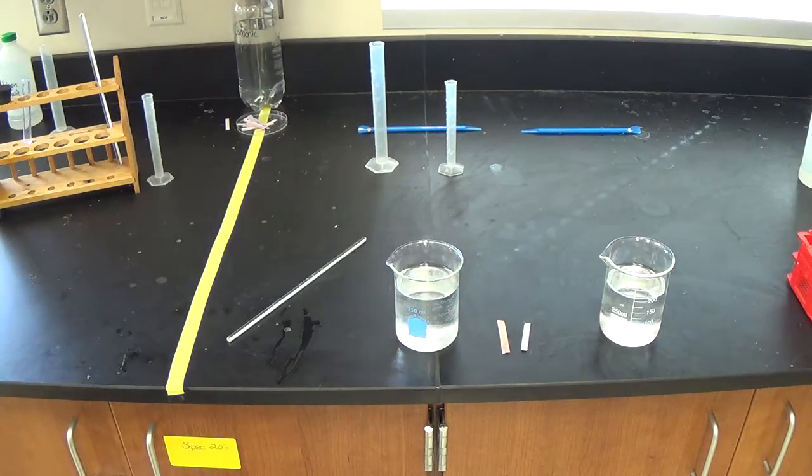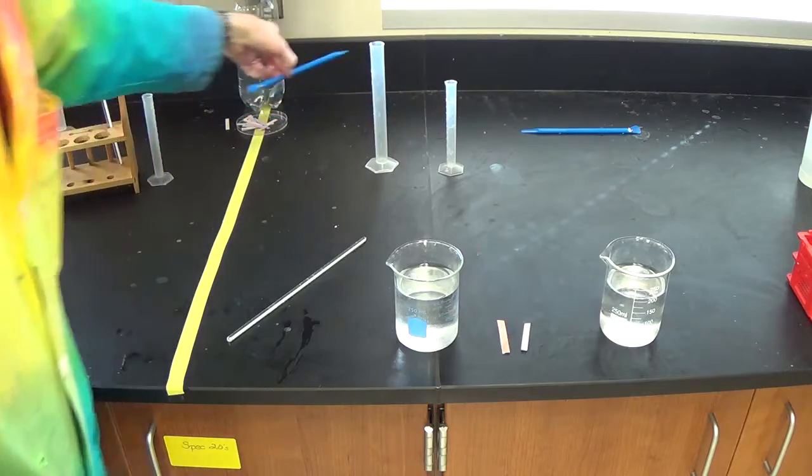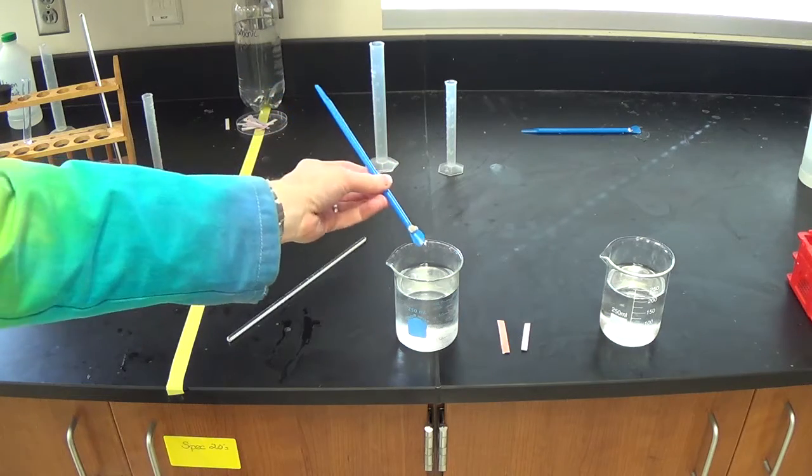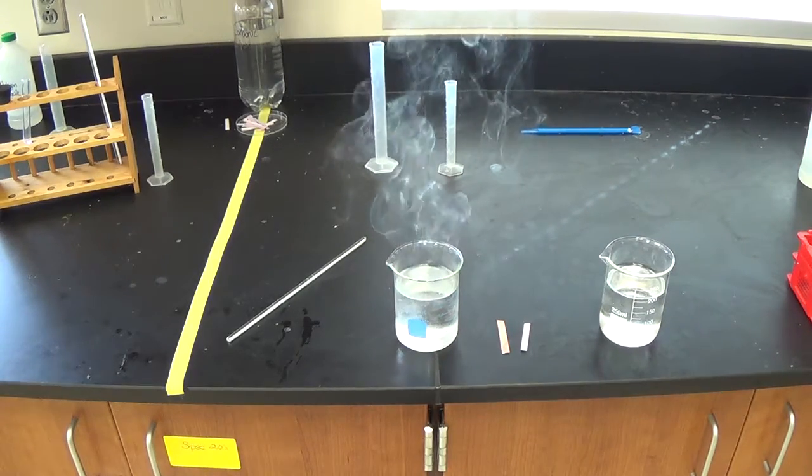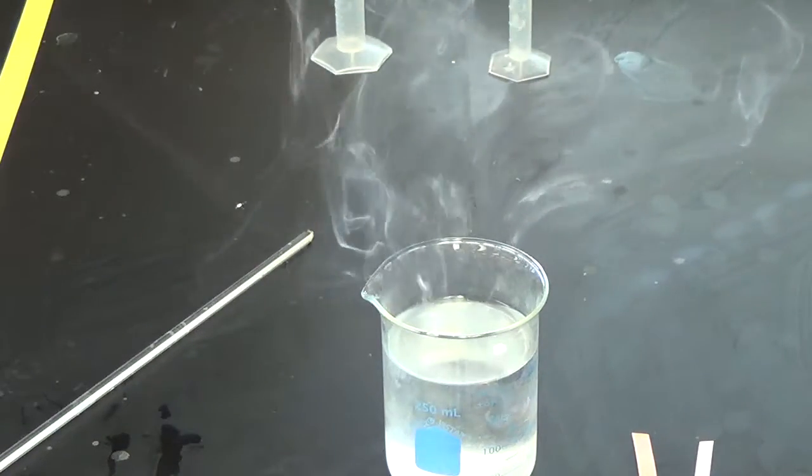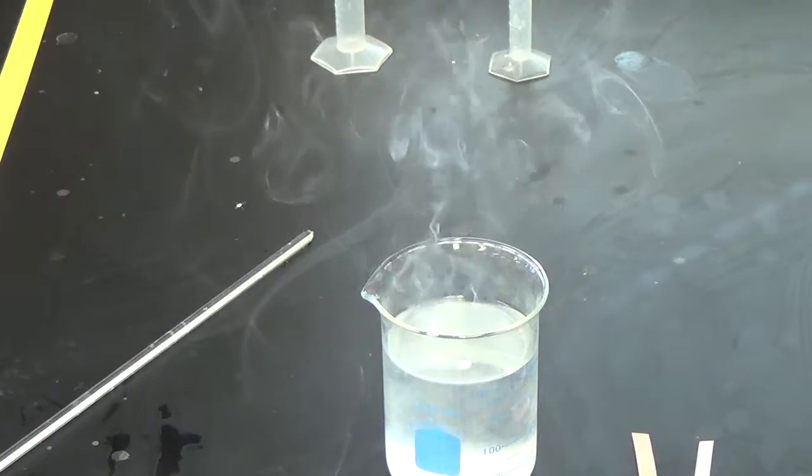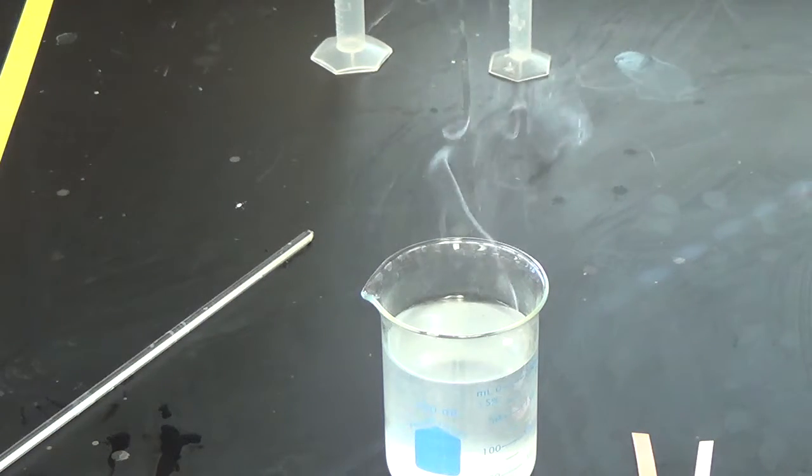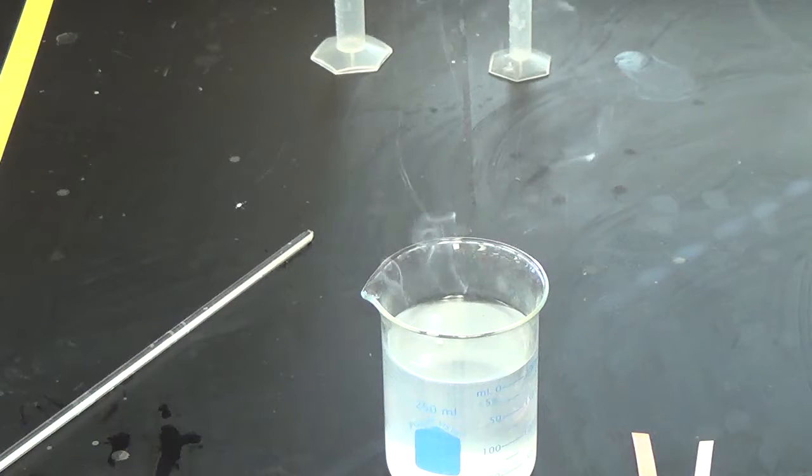Now we're going to actually do Reaction 1. I have water in the beaker, and I'm going to take a small piece of sodium metal and place it into the water in the beaker. You can see it certainly gives off a lot of energy. The sodium is spinning around the beaker. It is producing a gas, and that's what's thrusting it around the beaker. You can see the fumes coming off of it. Sometimes it's energetic enough that the gas will actually catch on fire, spinning around as a little tiny fireball. Pretty cool looking.